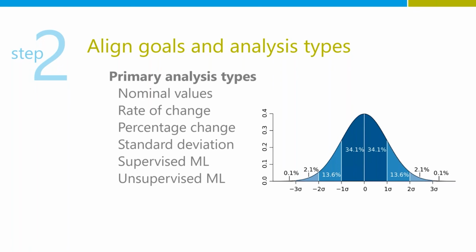So you're looking to set parameters based upon those rates of change to determine what's good or bad. Percentage change might just be you expect it to be at a certain value, such as maybe 10, and you're going to say that maybe 2% deviation plus or minus of this is okay, but 5% might be bad. So you're going to classify that in that sort of manner.